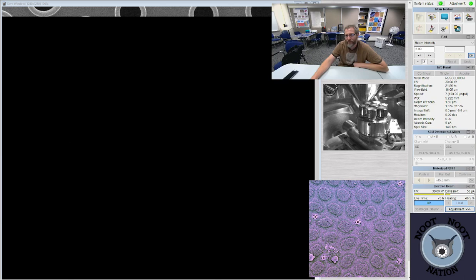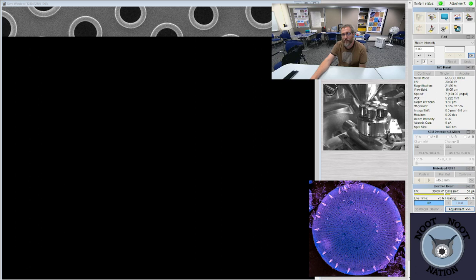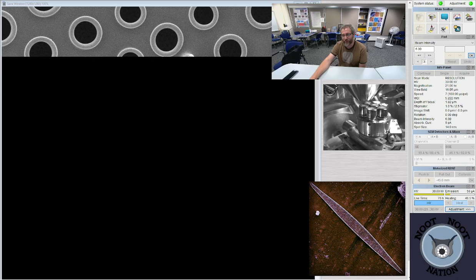Okay, can they close them? No. They're part of the skeleton, so they're made out of silica. They don't open or close. Do they have neurons? No. They're single-celled organisms. But they have cytoplasm? Yes. A neuron is a type of cell? Yes. And they're single-celled? Yes. You're all over it, Cargo Cult. You didn't need my help.